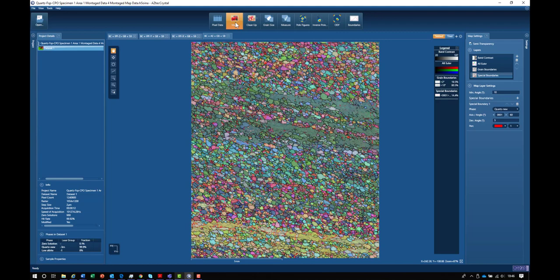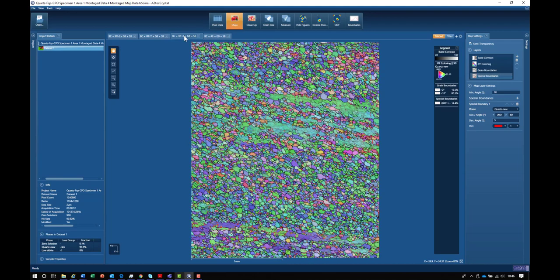Normally what we do is use an inverse pole figure coloring scheme. This is an inverse pole figure X scheme, which means it's coloring each point according to which crystal direction is parallel to the X direction of the map.